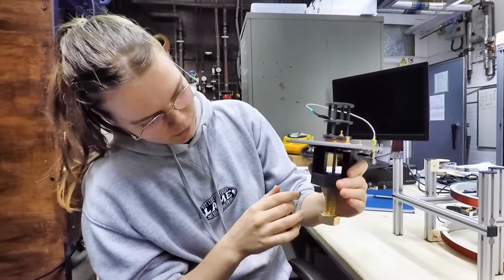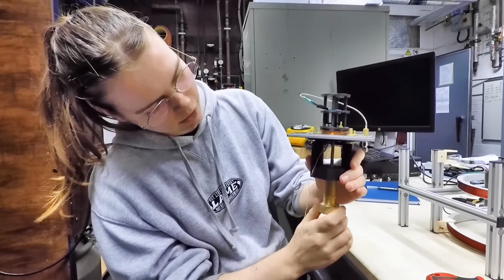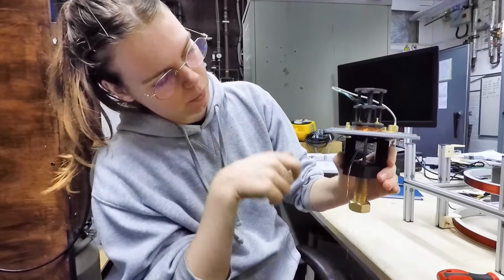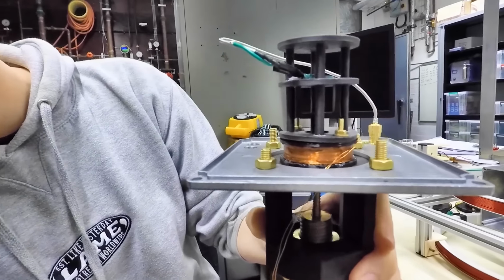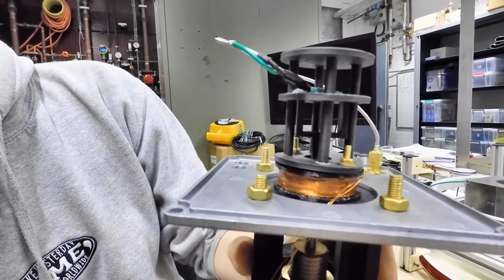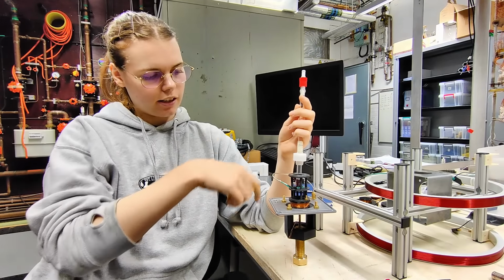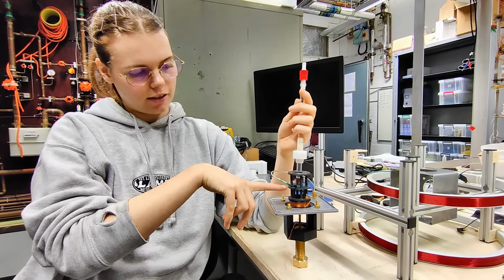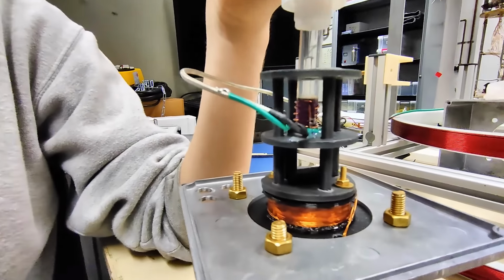Okay, so we've got the full assembly of this bottom part here, and you can see that when I move this screw, this platform will move up and down. So this is how it will look with the sample inside. So then the resonator should sit just above the coupling. So that's an overview of the apparatus and a little bit about how it works.